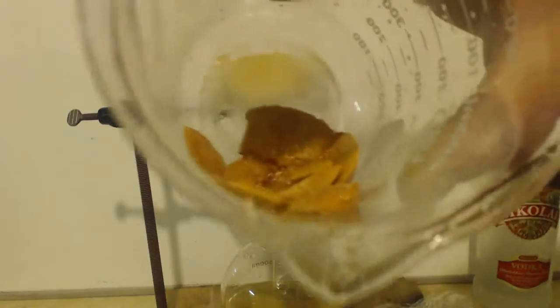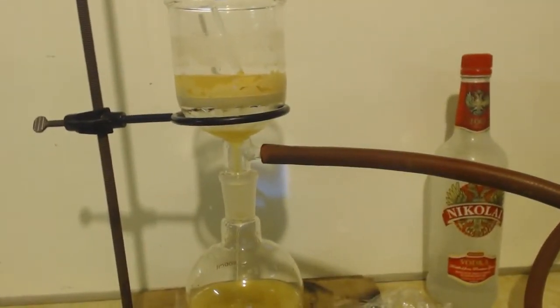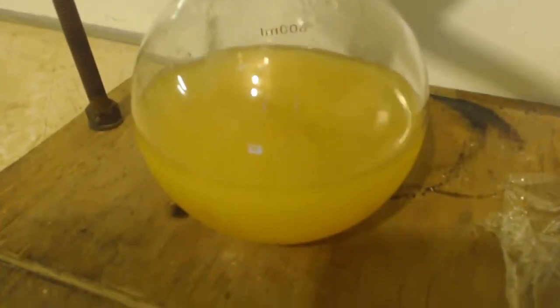Now you can see I got a bunch of this. It's kind of brownish, but there's a lot of it. And then got a little bit. You can see there's some in there. Not much though. So what I'm going to do after I get all that liquid out of there, I'm going to take this and add some water to it. I'll put it back in the freezer and see if I can precip some more stuff out. I can see some precipping out now.